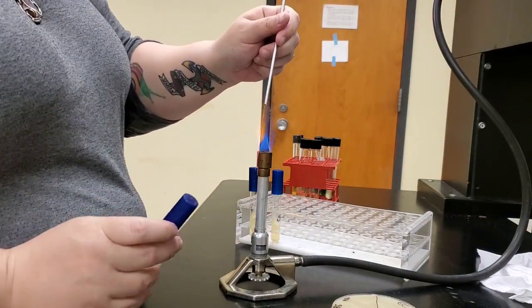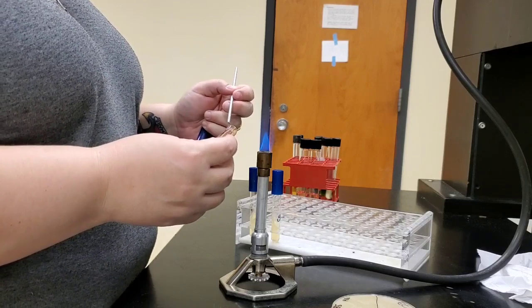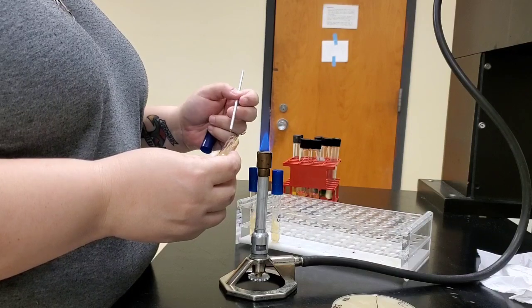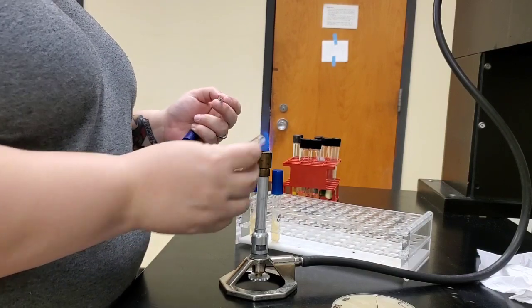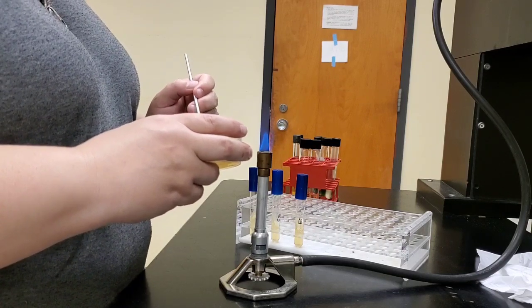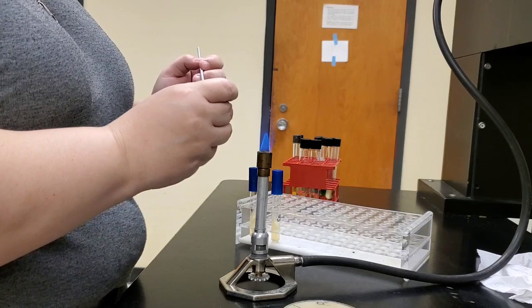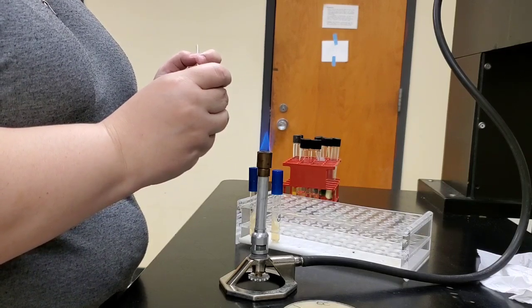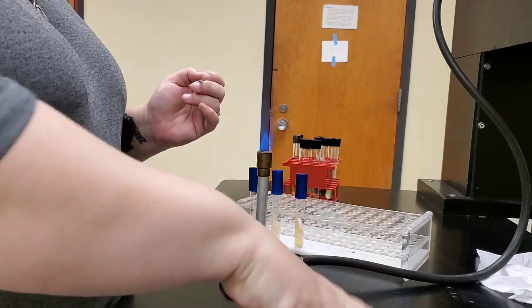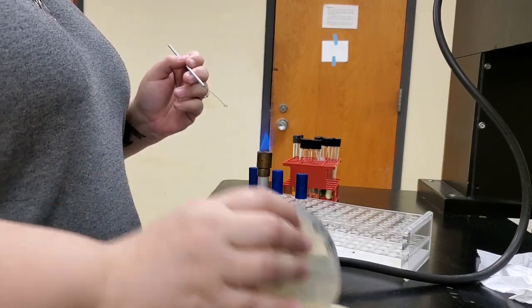And we'll do that for our third organism, Escherichia. Milk plate is complete. Starch plate is complete.